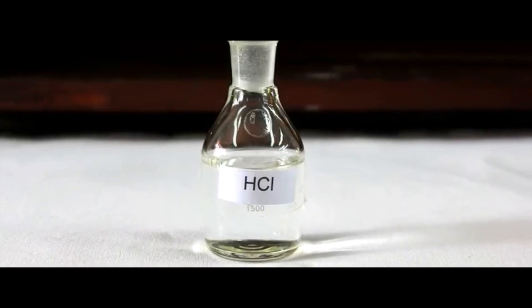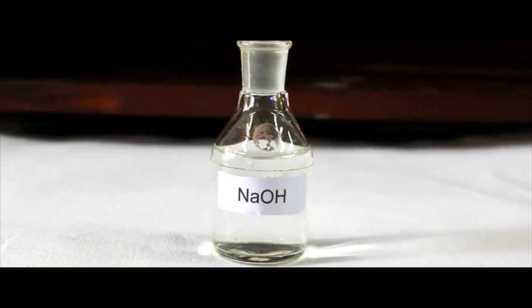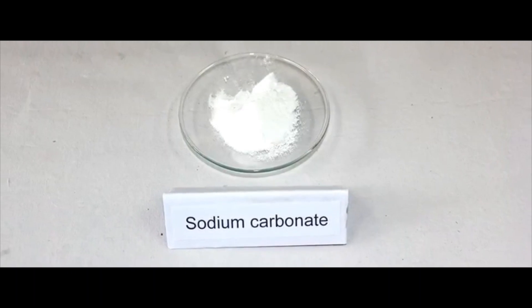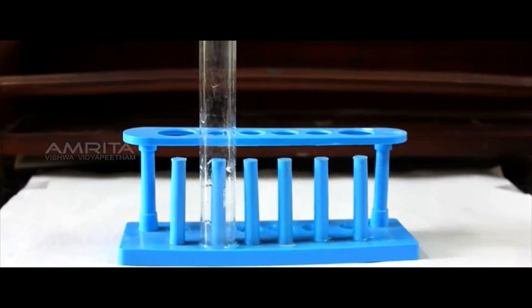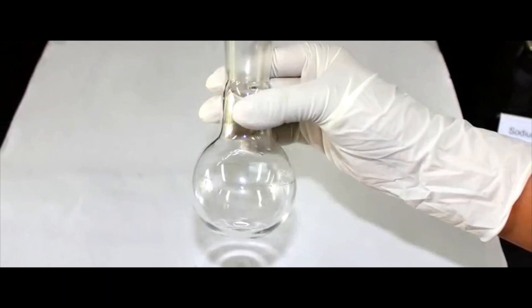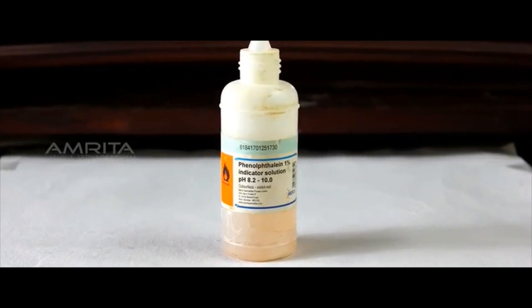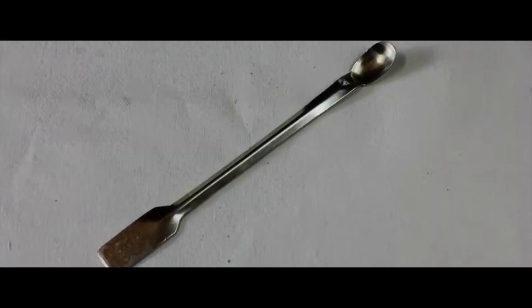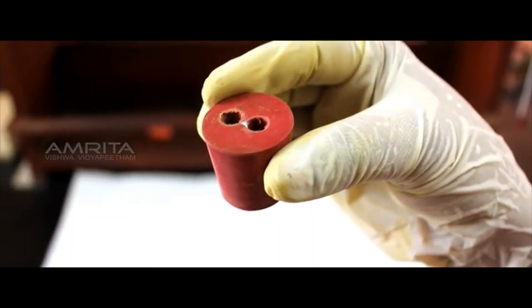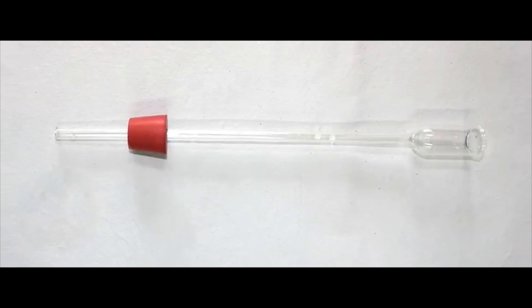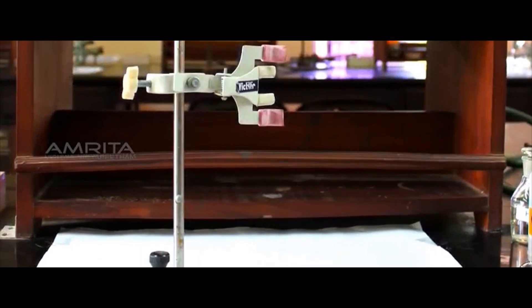Materials required: HCl, NaOH, dropper, test tubes, sodium carbonate, boiling tube, round bottom flask, phenolphthalein, lime water, spatula, double bore cork, bent tube, thistle funnel, and a stand with clamp.